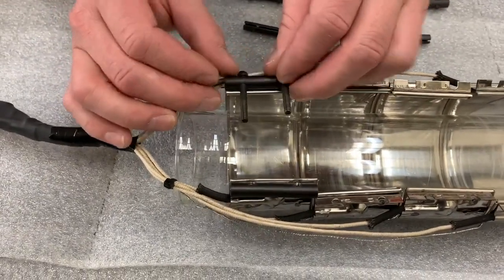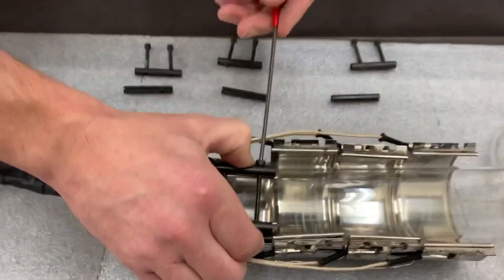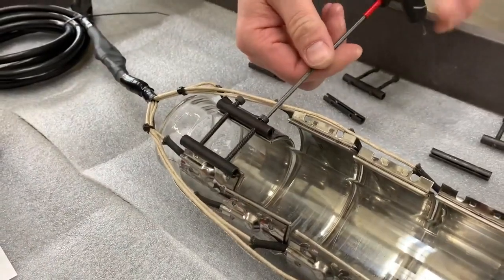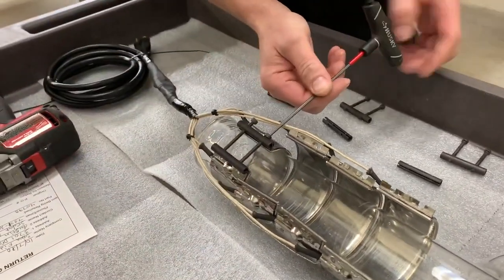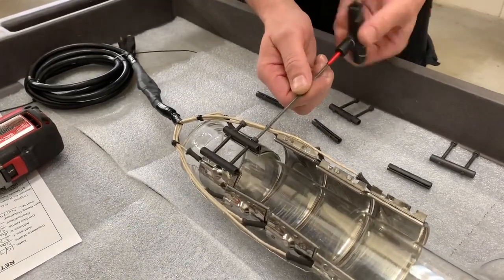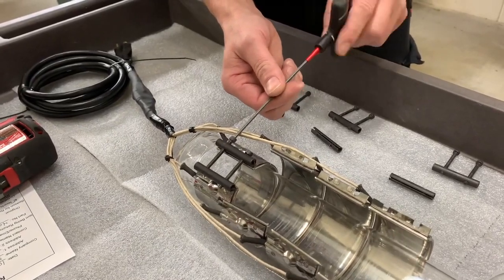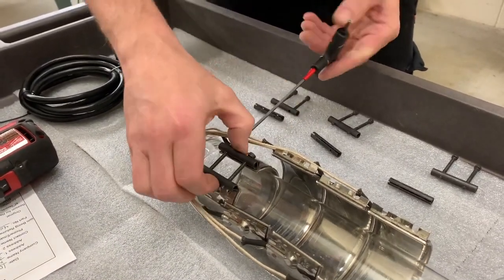We'll put the fittings over, squeeze the metal band together, and then we're using a three millimeter Allen key to start threading this in. Each of the bands will be installed in that same fashion.